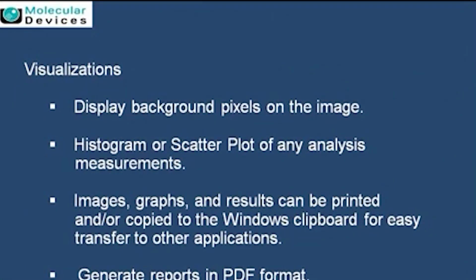So let's talk about visualization, like how one can really generate a good image which can be further used for analysis. Once the image is acquired, immediately the scientist wants to know how my data has performed. You gave a very beautiful talk on how the controls work, and especially a few people even use bacterial controls, which are non-related to the biology as such. They totally want to see just the assay controls. So first they check whether my assay has worked or not. The best way to do that is looking at the graphs, which show the differentiation in the level of backgrounds, and this can also be done at the level of different histograms and scatter plots.